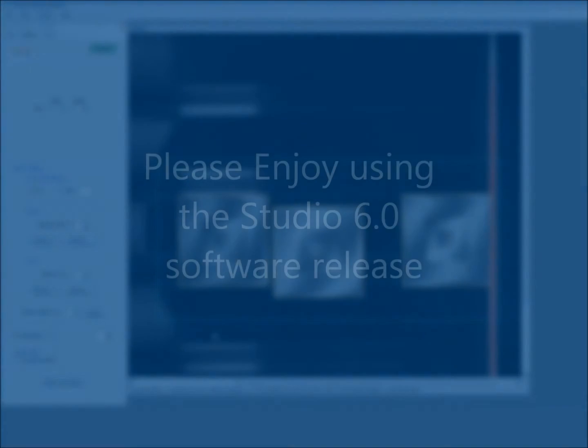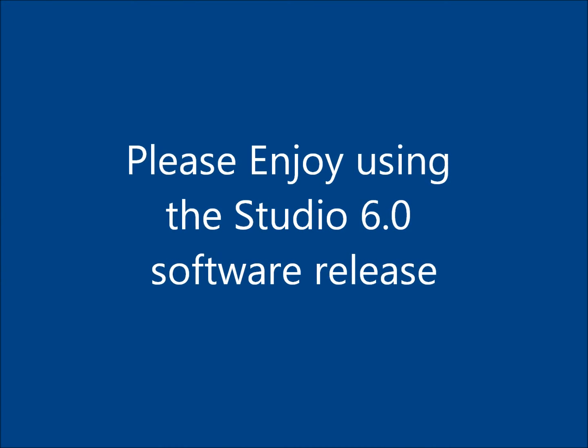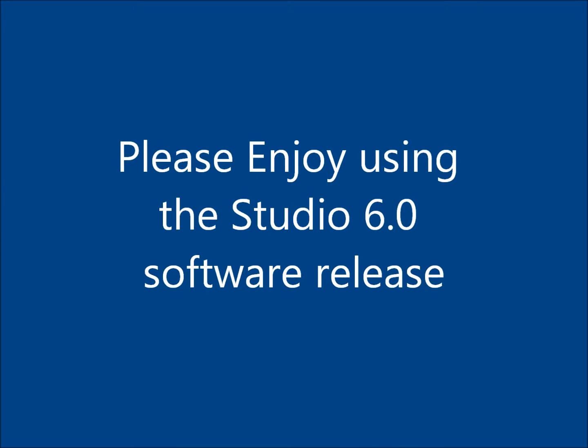Keep these test conditions in mind if part tracking is having trouble locating any parts in a given test. It is also worth mentioning that whiter painted parts will typically produce the best part tracking matches. Akrometrix equipment users should now install and begin using the Studio 6.0 software release on their studio-capable equipment.